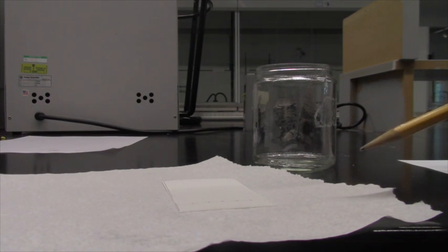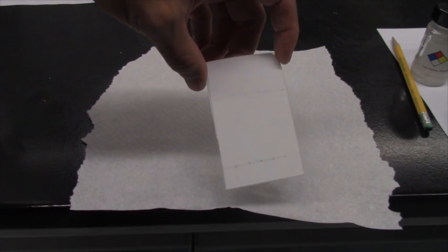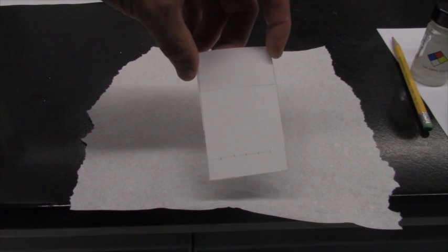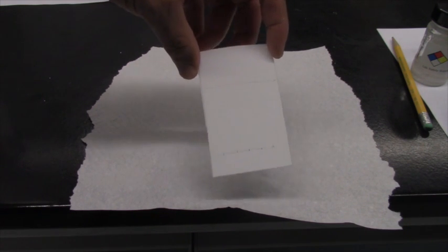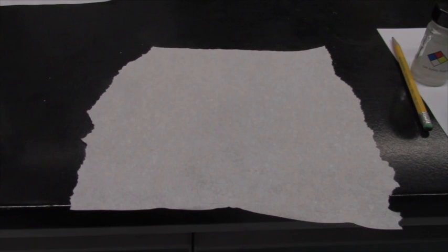Another thing I want to mention about the TLC plates is that it's important to only handle it by the edges or using tweezers. Okay, so my TLC plate is now dry, and I can take it into the back room to use the TLC Visualization chamber and go ahead and look at where those spots show up on my TLC plate. So here's what my TLC plate is going to look like under the UV light, so I can clearly see the spots for my different compounds.